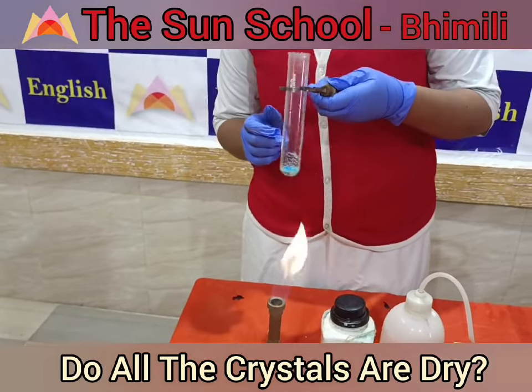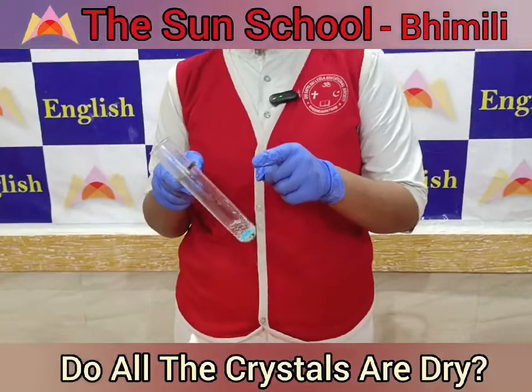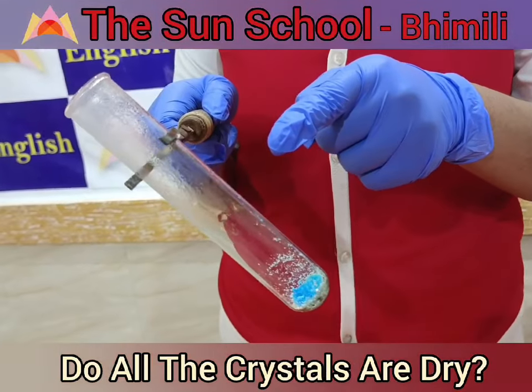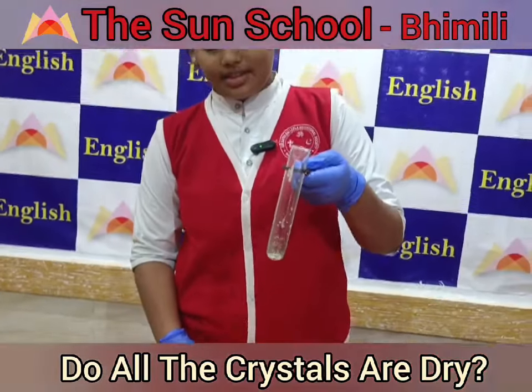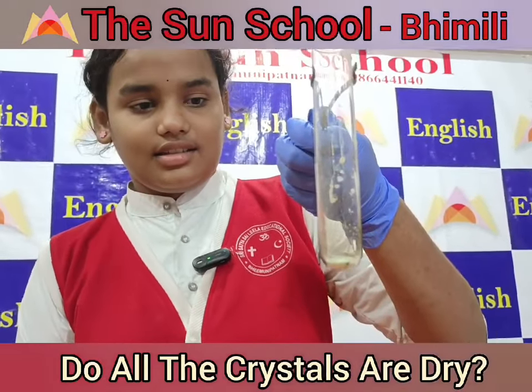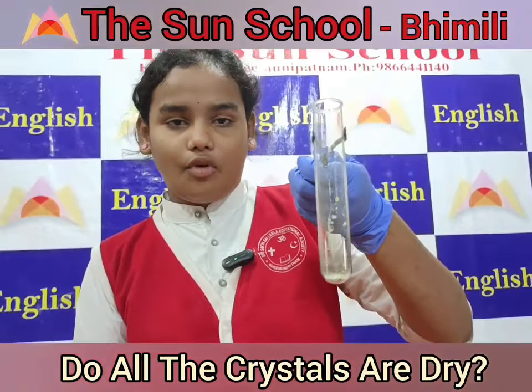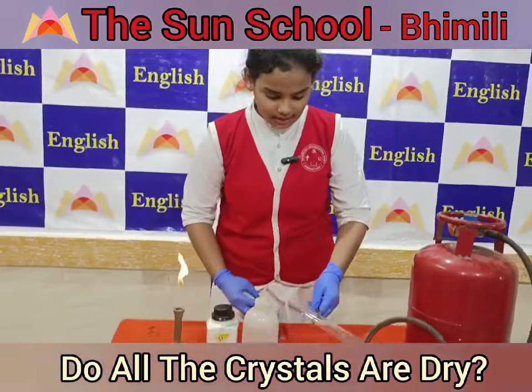We can observe that water droplets are present on the walls of the boiling test tube. After some time, we can observe that the blue crystals turn into white crystals in a powdery form. Now, collect this powder in the watch glass.